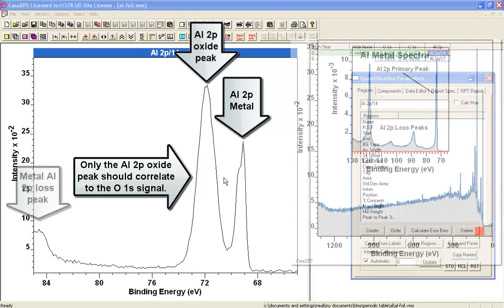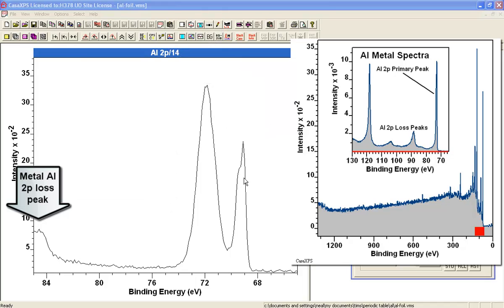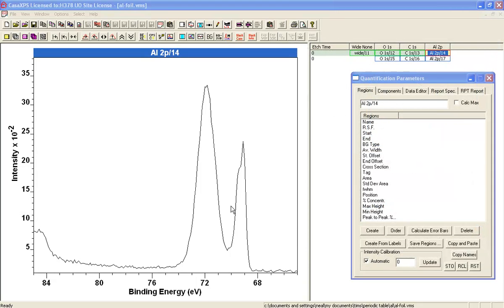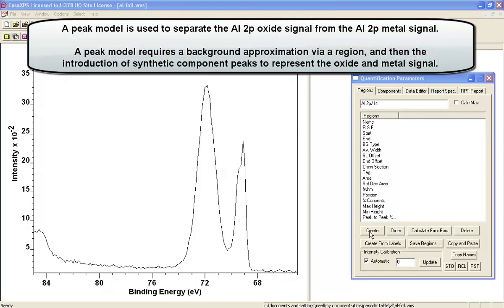So in order to work out the ratio for the aluminum oxide, we need to remove the metal from the signal of the aluminum 2p, and we'll do that by introducing a background and creating a peak model.